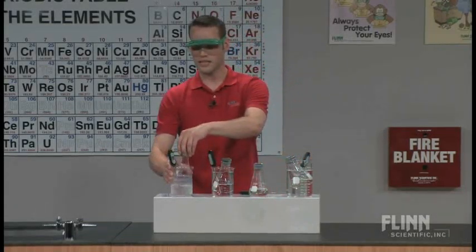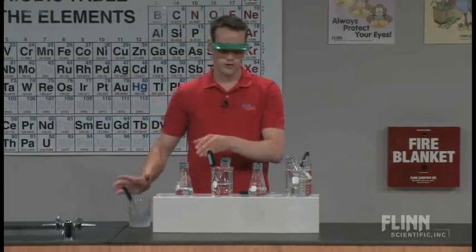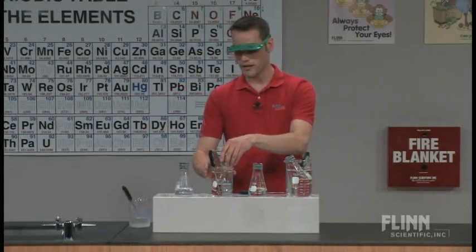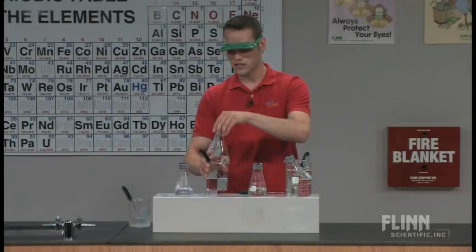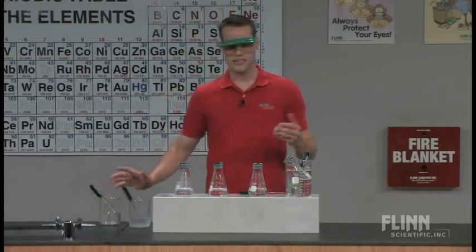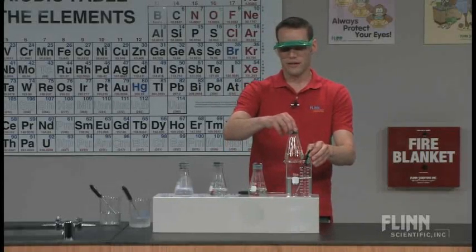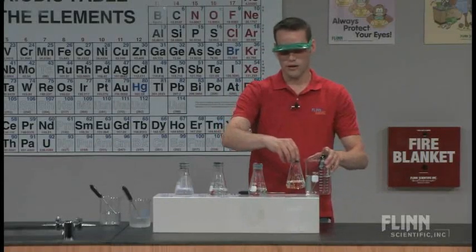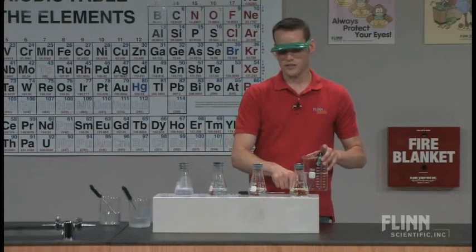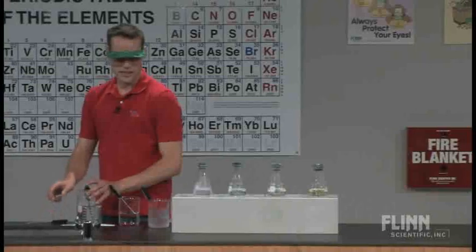So I'm going to pull all of these out of their solutions, knowing what temperature they're at. So we have about 2, 12, 25, and 38. So we've got about 10 to 12 degrees difference between each one. You can try to get exactly 10 degrees Celsius difference. I've never been able to, so I don't bother. I just get high, low, and some middle ground temperatures when I do this in class. You can also see a little bit here, this is getting yellow, so it's starting to decompose a little bit. These don't last very long.